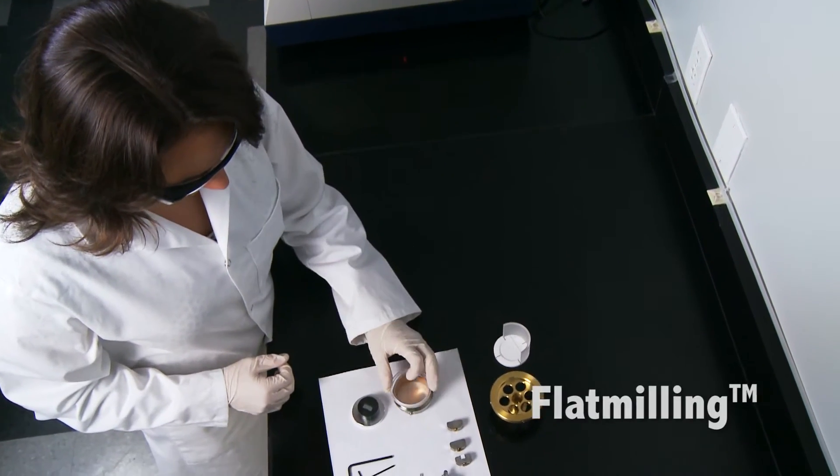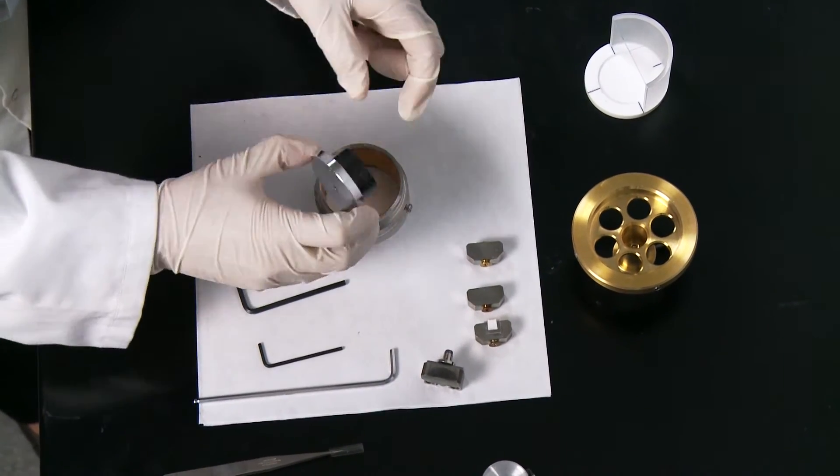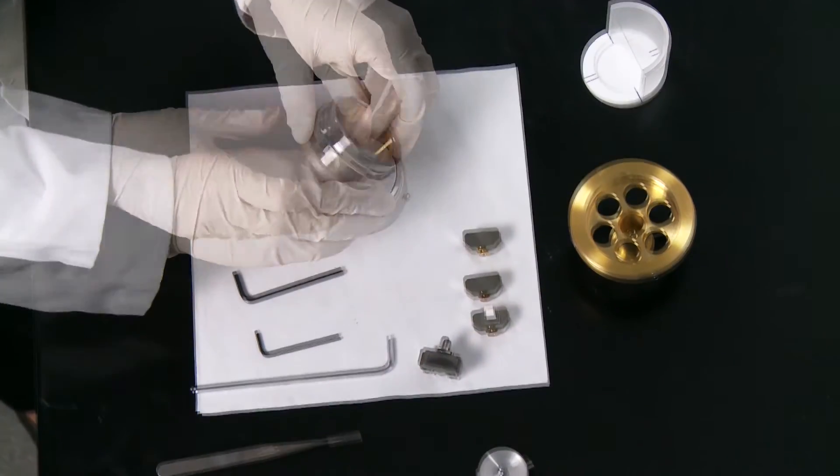Cross section and flat milling can be performed on the same holder to be used for scanning electron microscopy. After milling, the sample holder can be placed directly into the SEM for analysis.